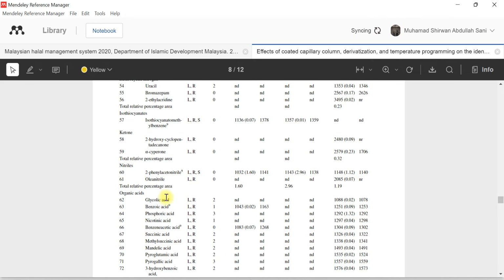Oh, saya cari je compound ni. Lepas tu saya search lah dia punya dalam... Sebab yang ni saya fokus dengan 90% and above saja. Meaning that daripada awal saya dah decide saya nak compound apa. These are just to compare sahaja.